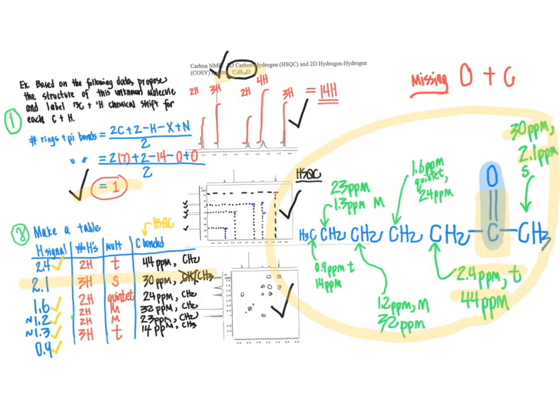So with that, I strongly advise you to dig into the practice problems to try for yourself, working through solving the structures of organic molecules based on the 1D and 2D NMR data that we have evaluated.